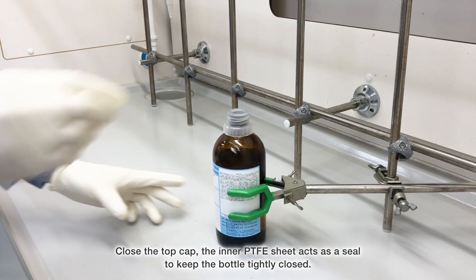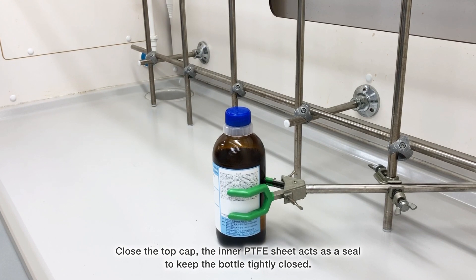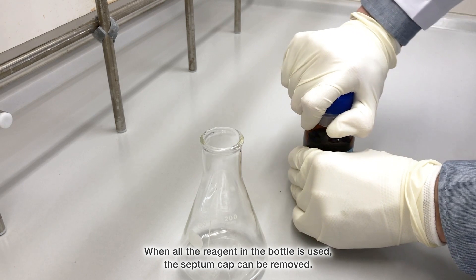Close the top cap. The inner PTFE sheet acts as a seal to keep the bottle tightly closed. When all the reagent in the bottle is used, the septum cap can be removed.